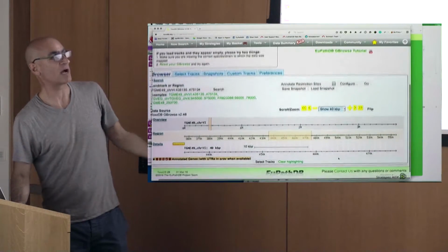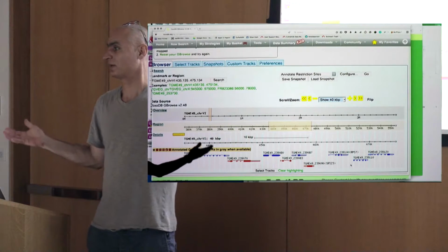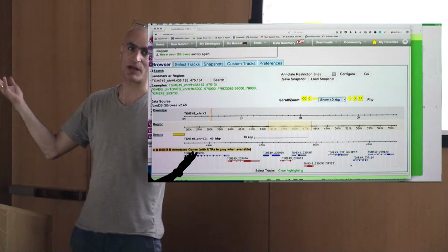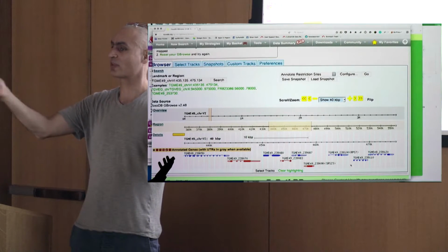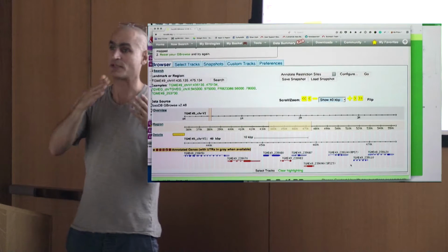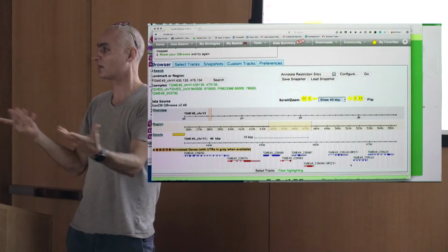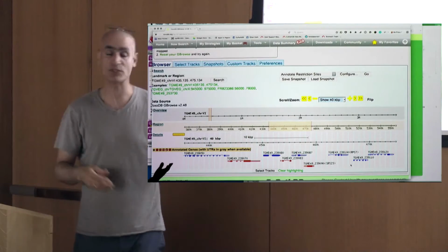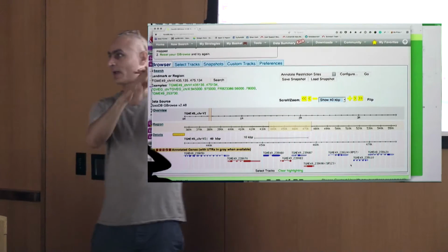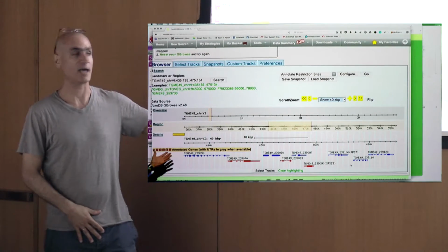All right, so the Genome browser. Imagine Google Maps, basically. When you're looking at Google Maps, you're browsing the world, looking at addresses, locations, streets, traffic, and you may look at distances between one place and another. You may look for restaurants, but these are all things that are decorated on a map. A genome browser is essentially a Google Maps for genomes. Instead of looking at a map, something we're familiar with, where you know what streets are, we're looking at genomes.